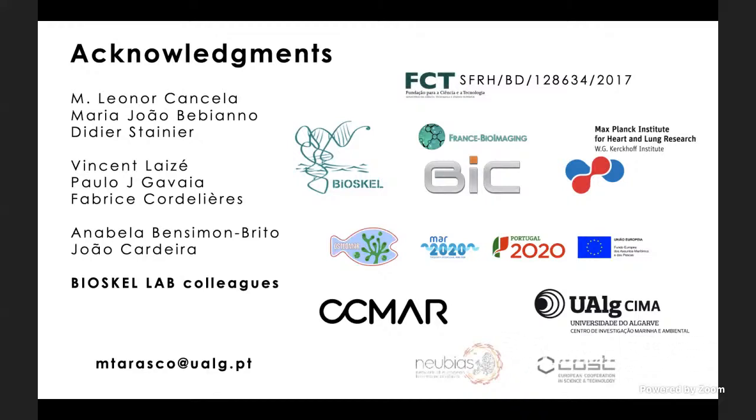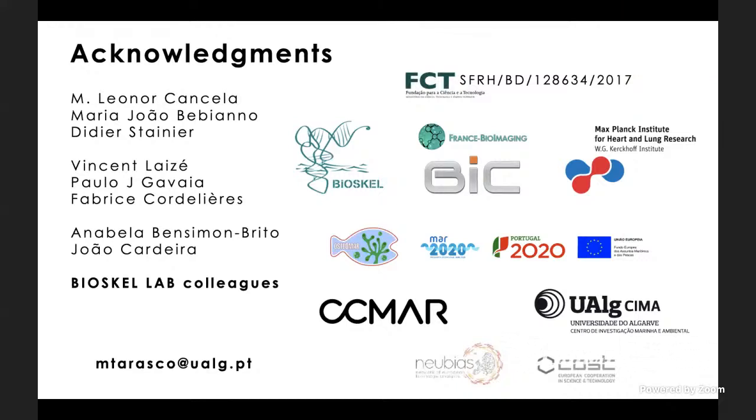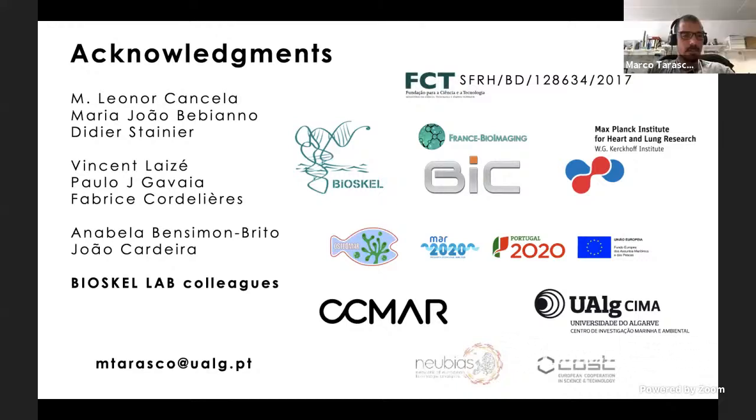Marco, do you hear me? Yes. Are all these macros available on the internet or only the ZF bone macro? For the moment, only the ZF bone is available. The one in collaboration with Elvira, the paper is under review, so hopefully soon a tutorial will be available online on YouTube and also a GitHub page. And now I'm working on publishing the other macros, the ones for behavior, eggs, and goblet cells.